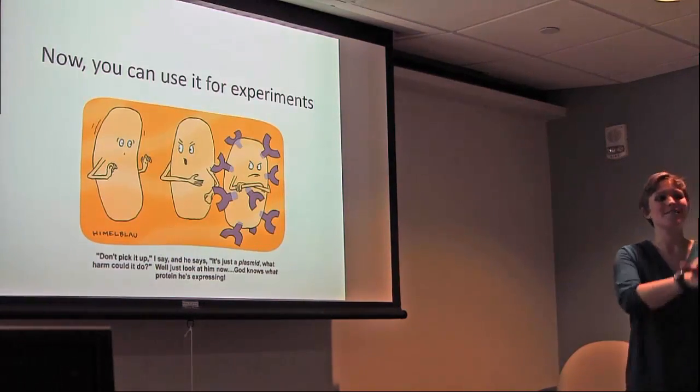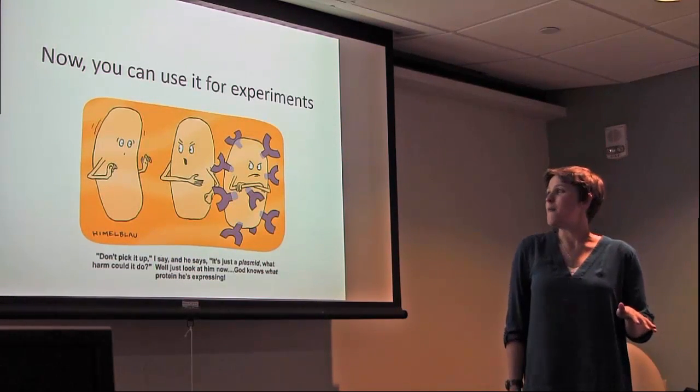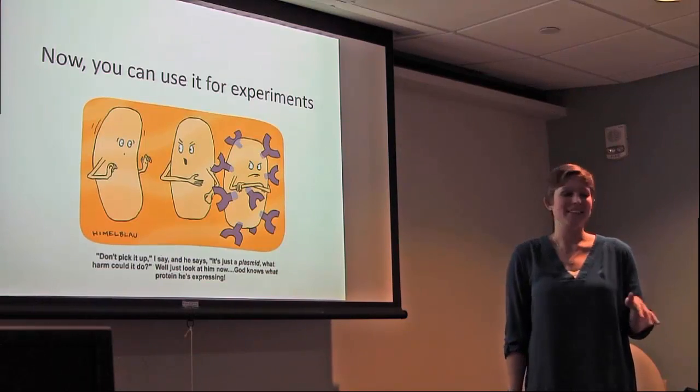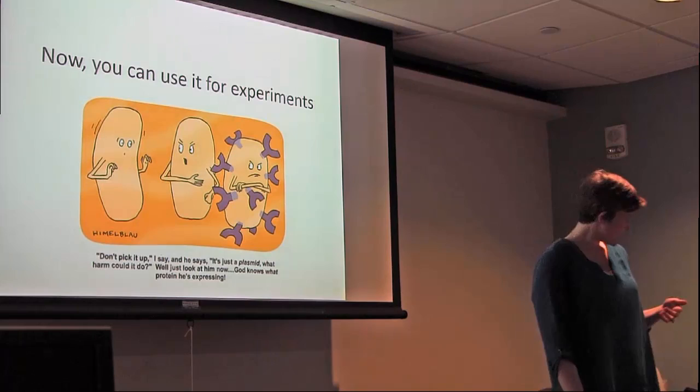Okay, so now once it's all been made and validated, you can use it for experiments, and ultimately the cells should express your gene of interest if they take up the plasmid.